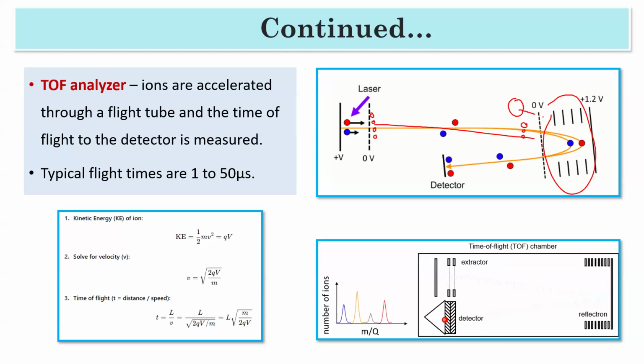So they will not go as far inside and can come back out easily. If you have a small one, it can go deeply, and then it will come back. What I want to say is that if there is a difference in the time taken by them, this reflectron will help by balancing them, and then you will get better resolution. So that is the main principle.